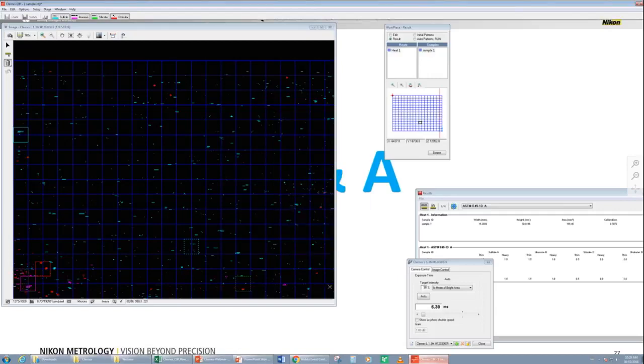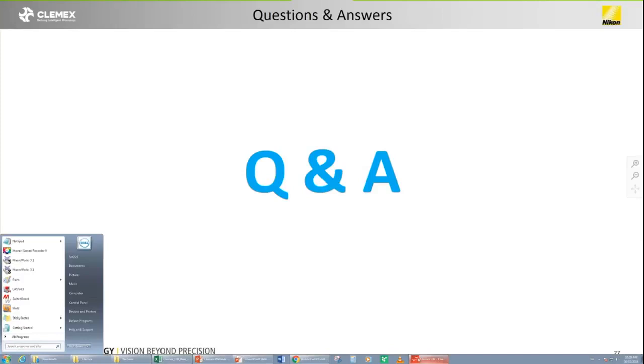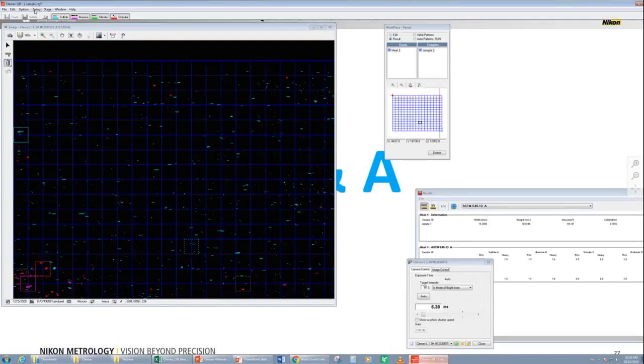Okay, thank you. A third question I received was, we don't have silicate in our steel. How will your system handle this? If you don't have silicate in your steel, as in our sample that we just ran today, we have another option, in the INI file.